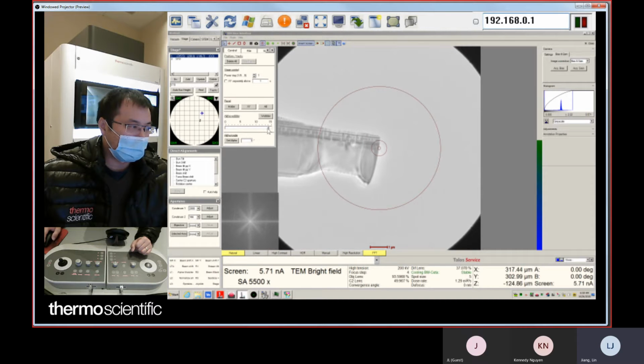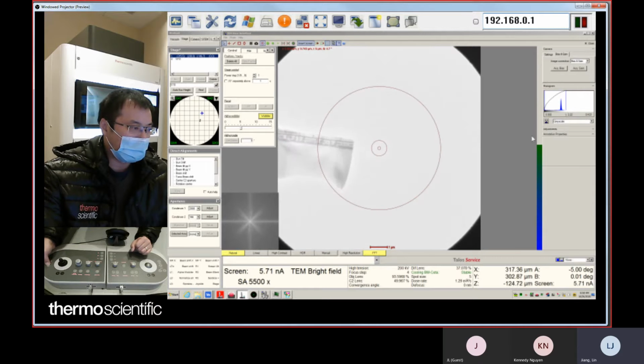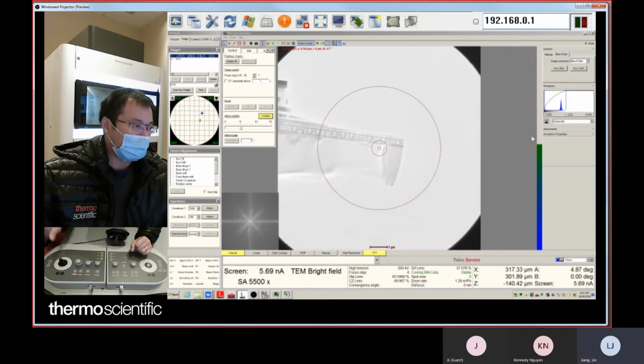You choose a small value, 5 degrees, and you wobble. You see, this gives you a smaller movement. So in this case, you can use Z to bring it close. Once it's close, you stop the wobble and change this value to 15 again to do fine adjustment.